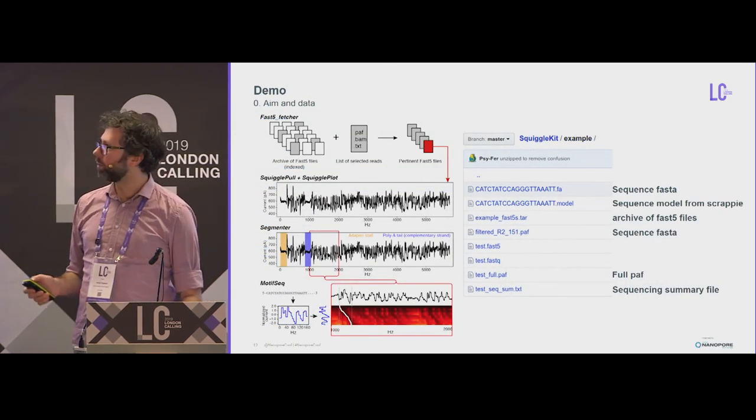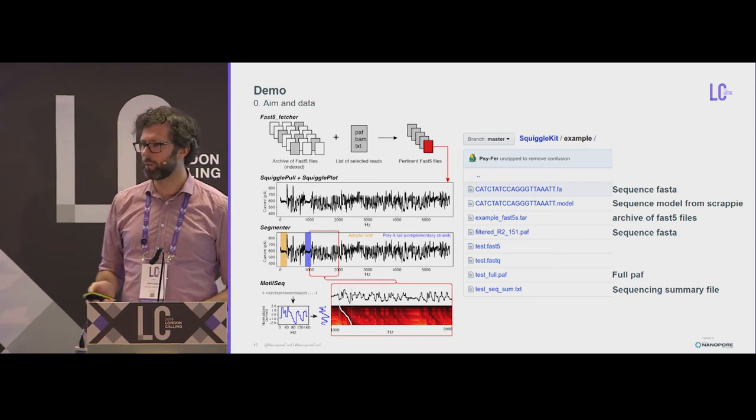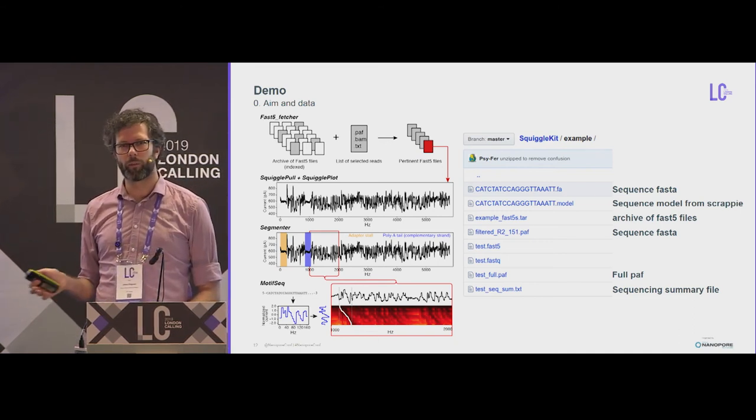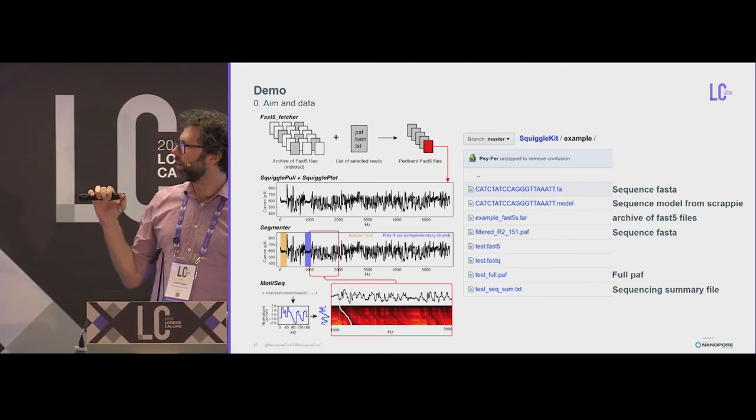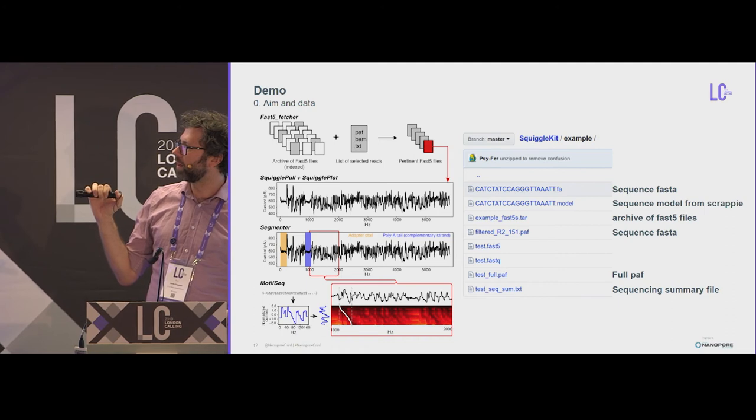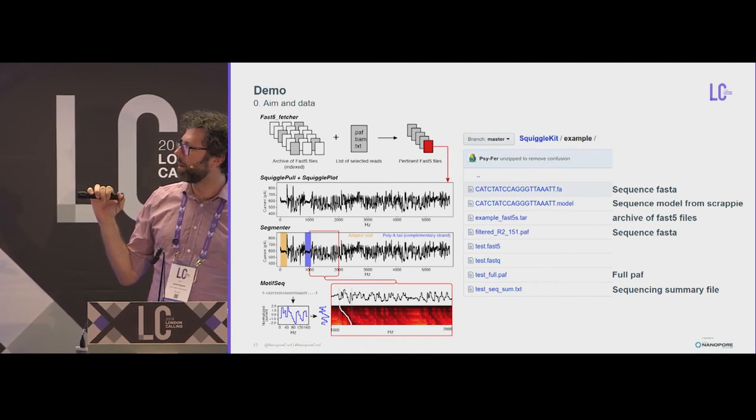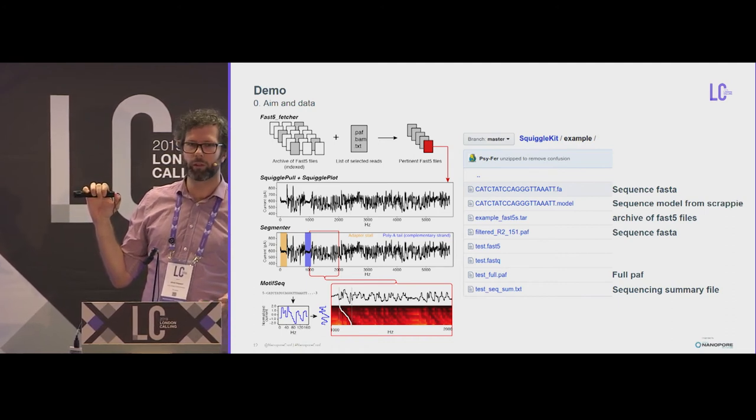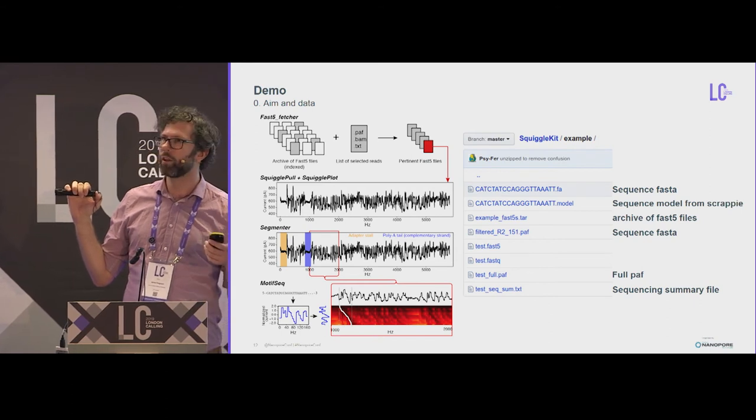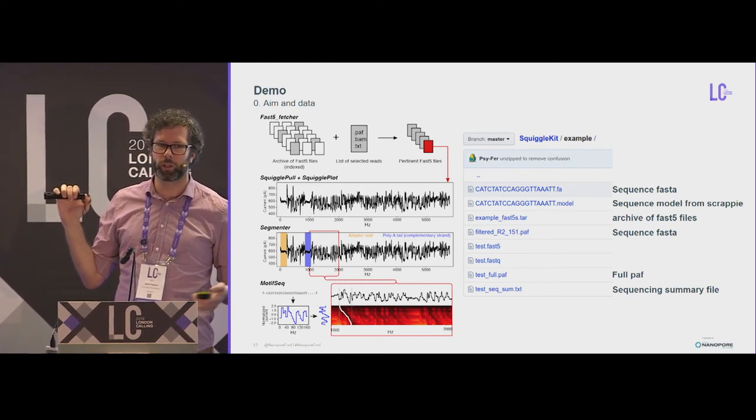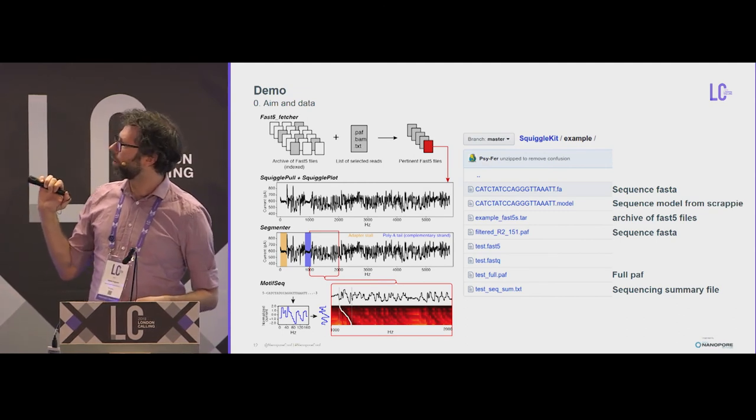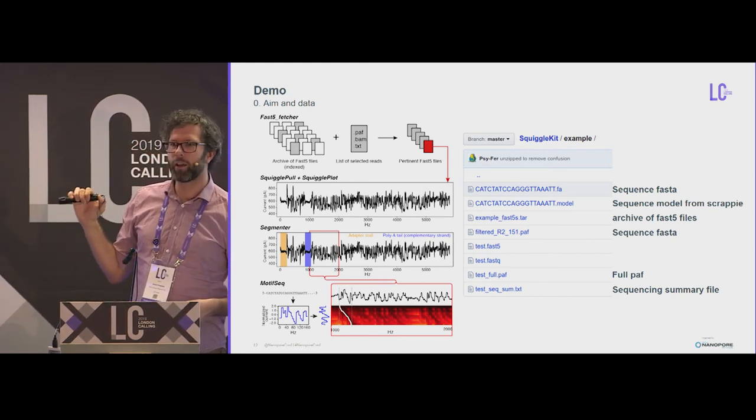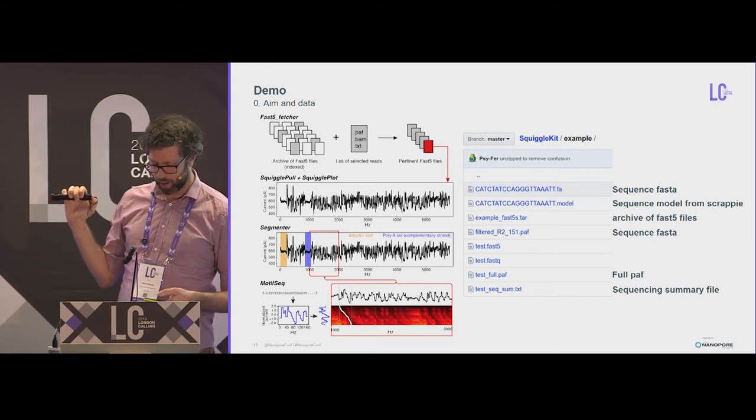So as a quick example, let's say, if anyone was at the talk from Martin Smith the other day, he showed this example of trying to find the three prime entity next to the poly T tail of a transcript that mapped to two regions, two different transcripts. And you want to find out which one's the real one. So on the GitHub, you can go to this example, and it has all the files you need to run through this example here.